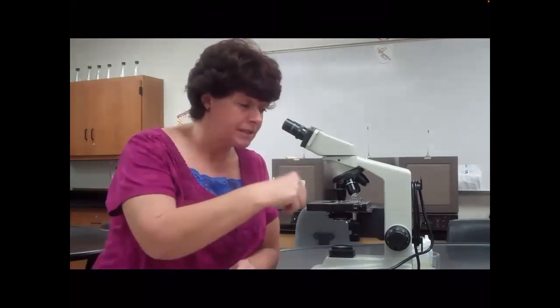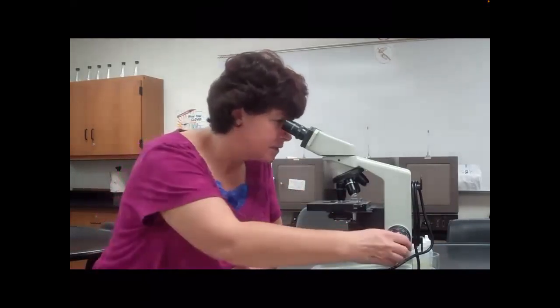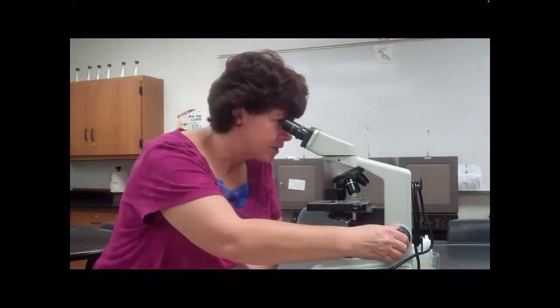What can happen is students get a little bit out of sorts, I guess is the word, and they put their slide on upside down, okay? You will have focusing issues on the 40 or the 100 if your slide is upside down. So if you can never focus on the 40, go back to the 10, lower the stage, take the slide off and see if it's upside down, okay? Now I'm focused on the 40. I can now go to the 100.